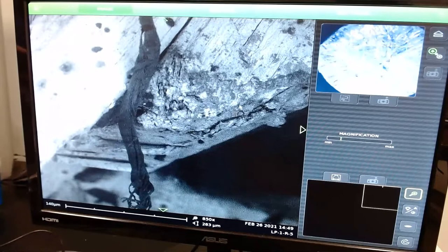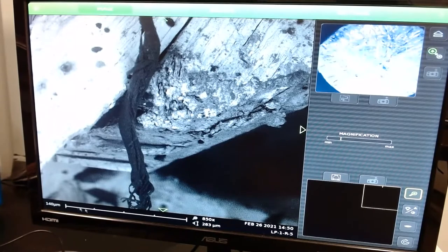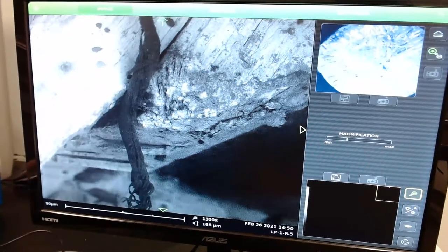Right. Well, what size are we looking at here? What would that be? 140 micrometers is this distance. Ah, look at that. That's pretty zoomed in, ladies and gentlemen.